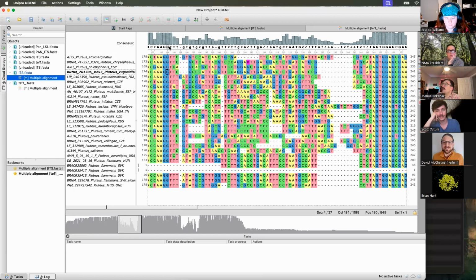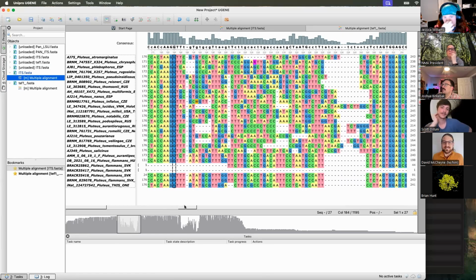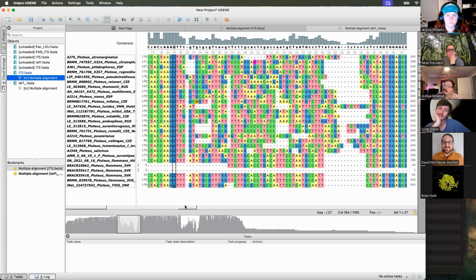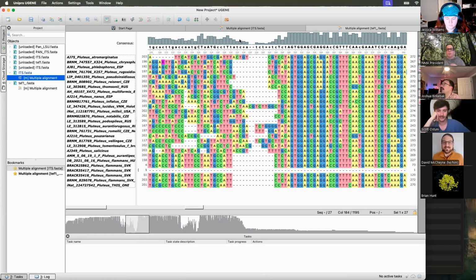Sometimes there'll be multiple GTs that could be near here, but this one should have no nucleotide variance unless there's poor sequence quality. If you have like 99.9% GTs and maybe there's one GC, it's probably sequencing error, but it should be basically all GT and then end in something that's all AG.